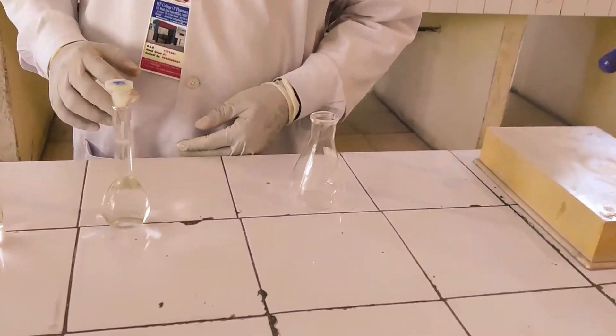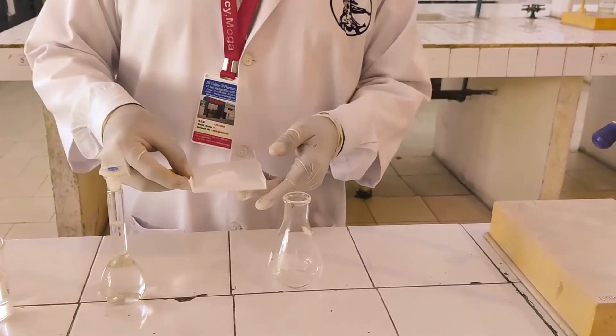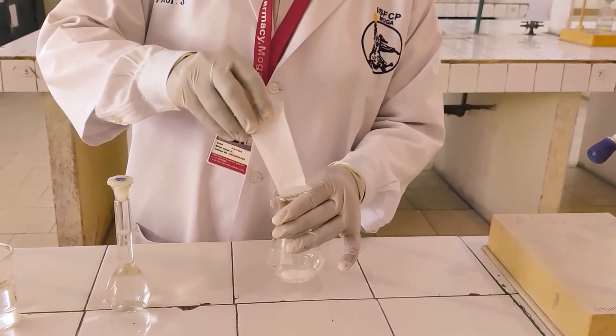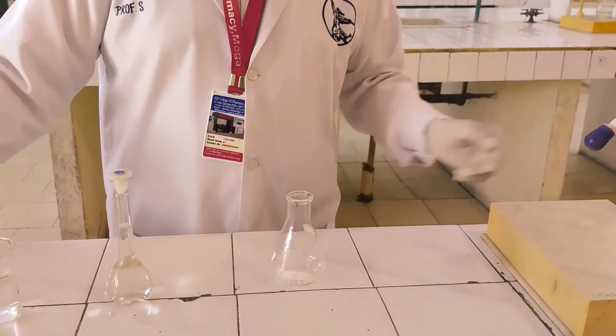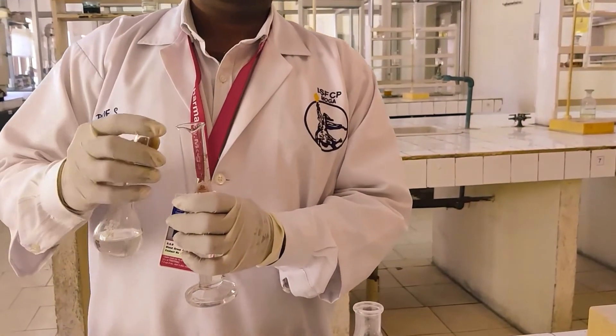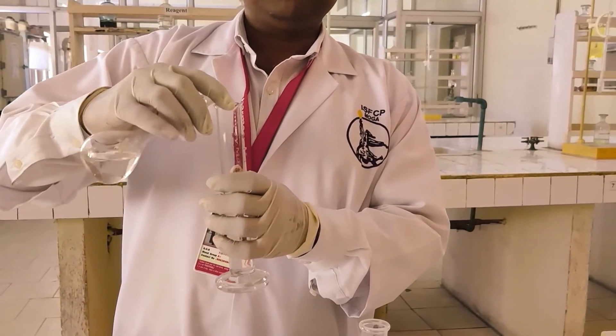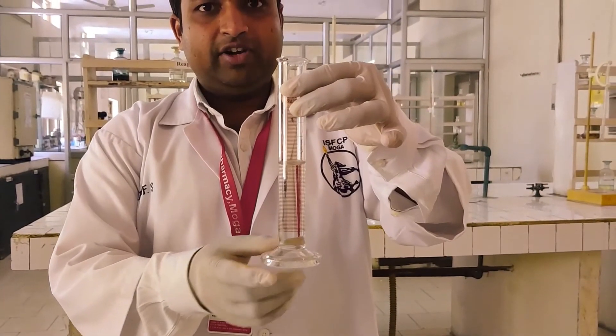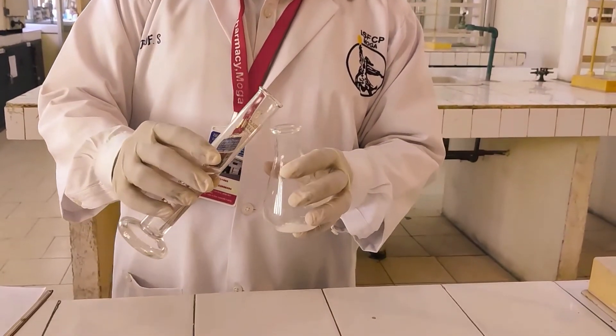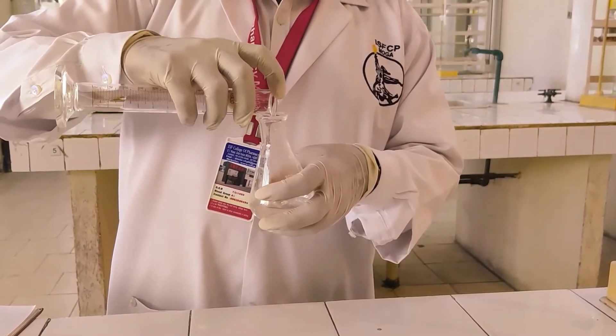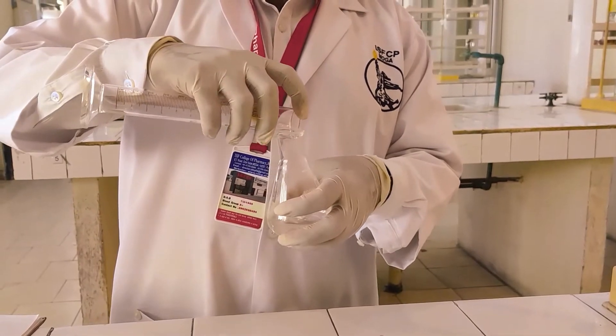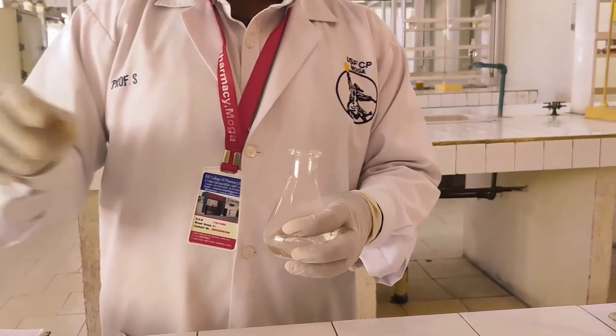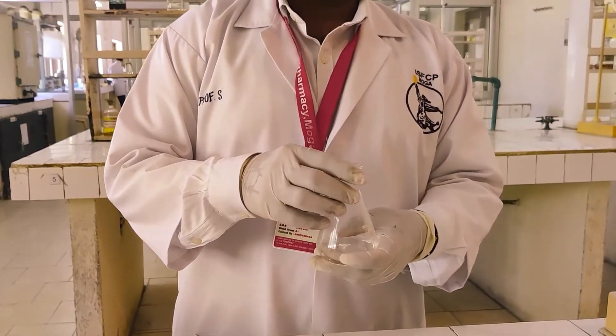Now the 0.5 molar NaOH has been prepared. In next step transfer the weighed amount of aspirin into the conical flask. Now measure the 30 ml of NaOH from previously prepared 0.5 molar NaOH in a measuring cylinder. This is 30 ml NaOH then add it into conical flask having 1.4 gram of aspirin equivalent to 0.5 gram of aspirin active content.